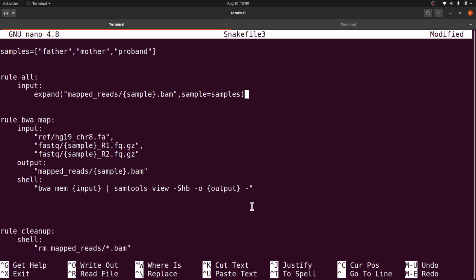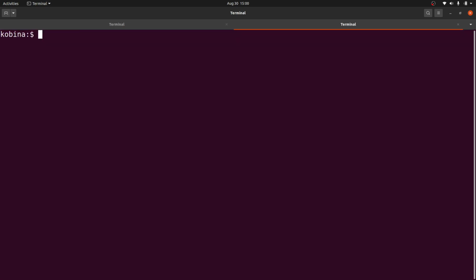And so what is happening is that we have this all right, but this input does not exist. All right, let's just look at it. Let's get back here. Let's ls into the map directory. Okay, so it even exists here, but anyway, we will clean it. We will come back to this. Let's clean it first so that it doesn't appear. Okay, we will just remove it first. Okay, yeah, so let's ls into this. Yeah, okay, so there it is. So now we don't have it there, so we can proceed.